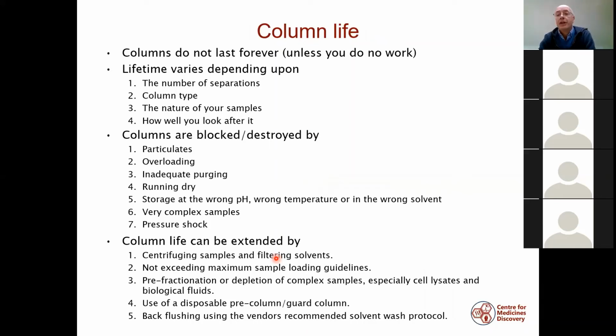So your HPLC column is a consumable. It will not last forever unless you never use it. The lifetime of your column varies depending on a number of factors. So obviously, the more separations you do, the shorter your column life. It depends on the column type, as I mentioned. It depends on the nature of your samples. The more complex your sample, usually the more likely it is to block your column. And it also depends on how well you look after it. So there are column care aspects to HPLC.